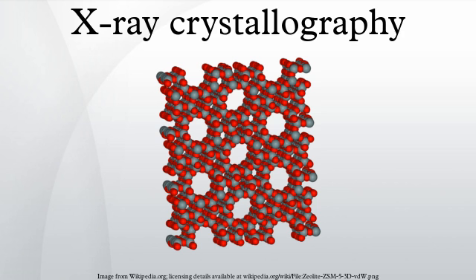Limitations. As the crystal's repeating unit, its unit cell, becomes larger and more complex, the atomic level picture provided by X-ray crystallography becomes less well resolved for a given number of observed reflections. Two limiting cases of X-ray crystallography, small molecule and macromolecular crystallography, are often discerned. Small molecule crystallography typically involves crystals with fewer than 100 atoms in their asymmetric unit. Such crystal structures are usually so well resolved that the atoms can be discerned as isolated blobs of electron density.